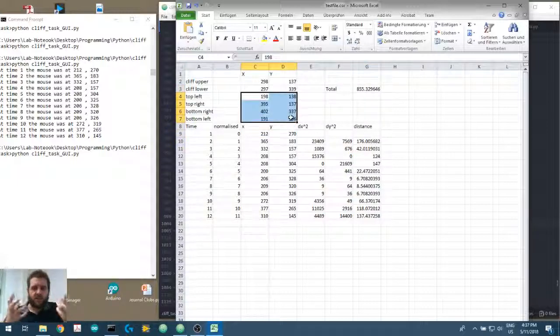Now this is using Excel. This is not the best way of doing this, but what I'm trying to do is show you the general thought process on how to calculate the mouse's position, the distance the mouse or the beetle or whatever it is that you're measuring has moved for each time frame that you have analysed. Okay, I'll leave this one here.